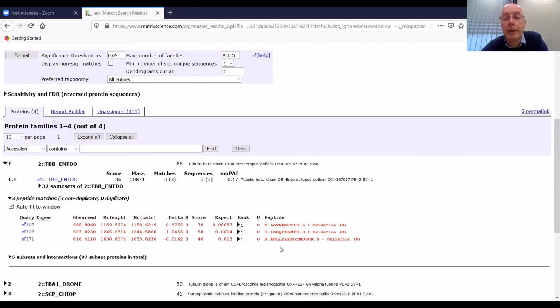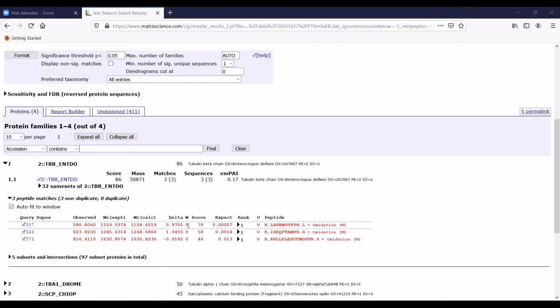If you saw a peptide that had an internal arginine somewhere, then the missed cleavages would be 1, which means that in order to generate that peptide, there has to be an arginine in the sequence which was not cleaved. And that happens quite frequently. I haven't got a data set to show you, unfortunately, but you can generate peptides with 2 or 3 or 4 or more tryptic residues which are not cleaved. That makes a lot more sense. Thank you. Any more questions?